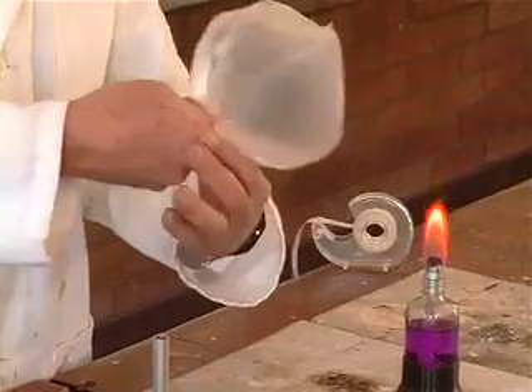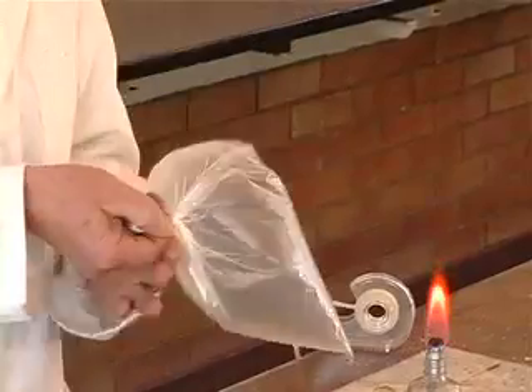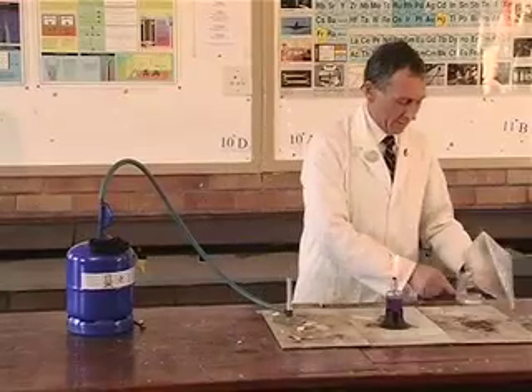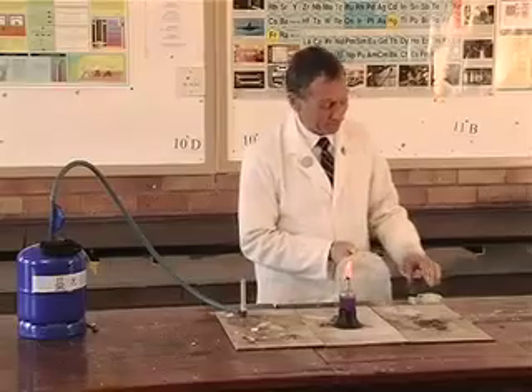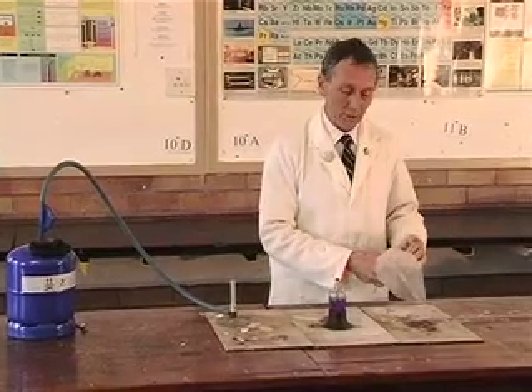If I just take it off there carefully and twist the neck of the bread bag like that, I'm going to steer clear of the flame. A bit of cello tape around the bread bag. Remember again what we're showing is the oxidation of the alkane gas — this is the one that goes on in motor cars.